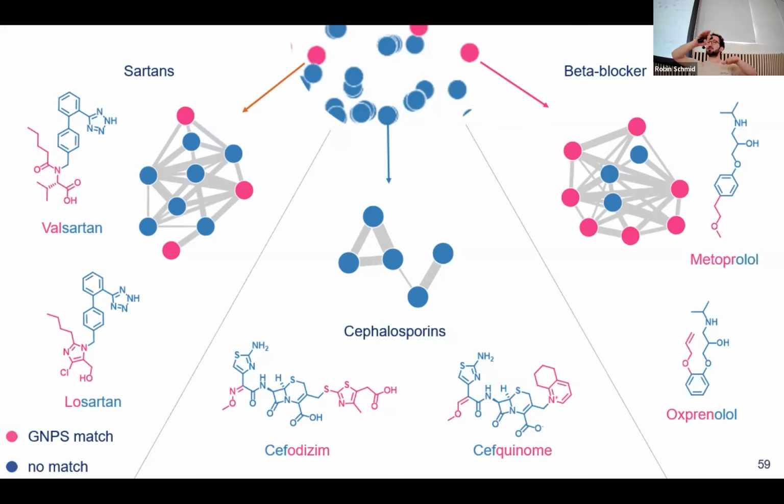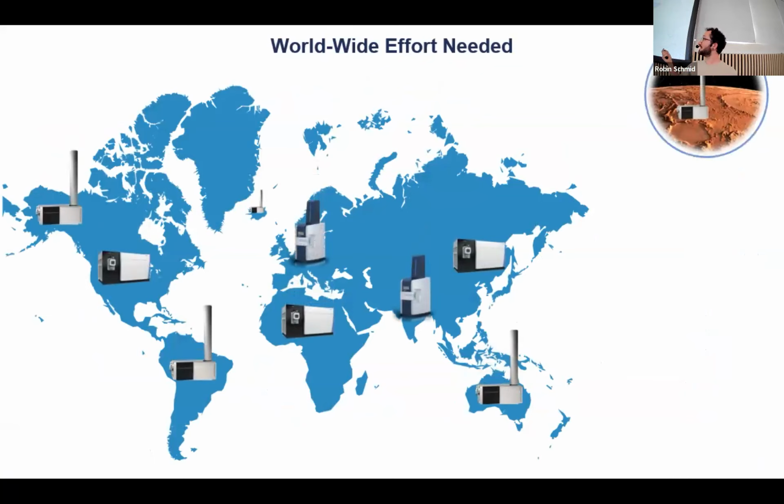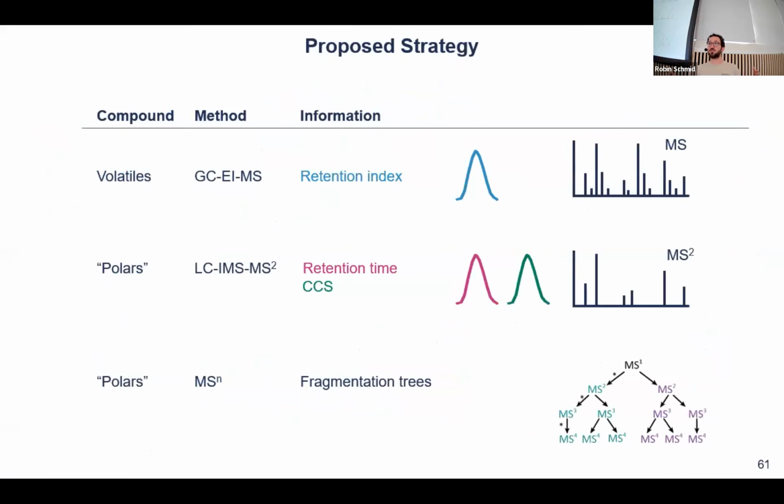So that already shows us that there might be some bias, of course, to compounds that are very easily bought and very easily accessible, and that also then later plays a role when we train models and so on. And so now looking back to the world and considering that there are so many mass spectrometers standing around, we would definitely like to leverage all of you to have compounds, maybe even produce new standards, right? And then measure them, and we facilitate the whole process.